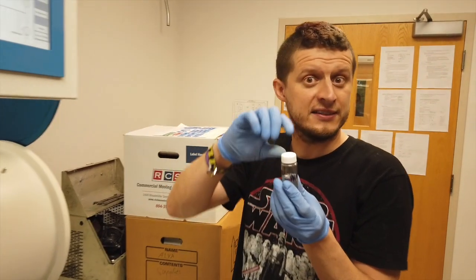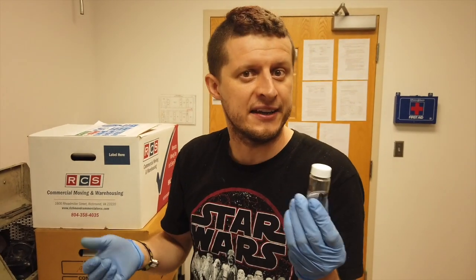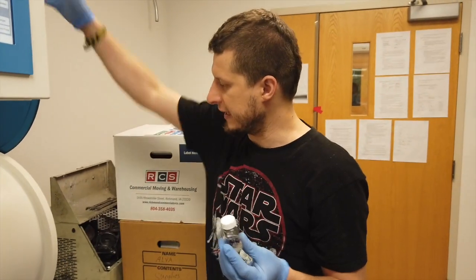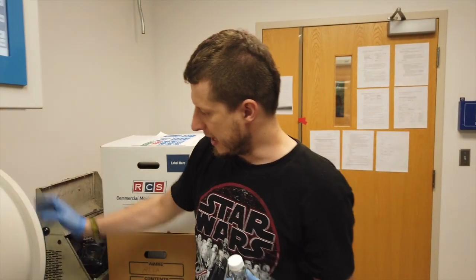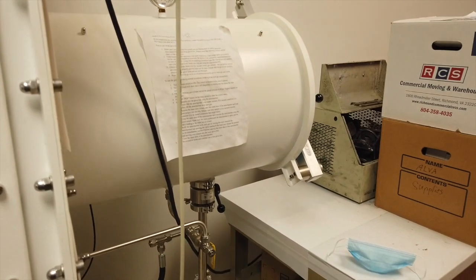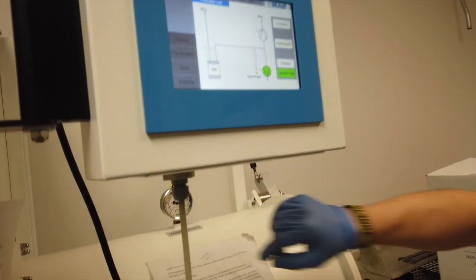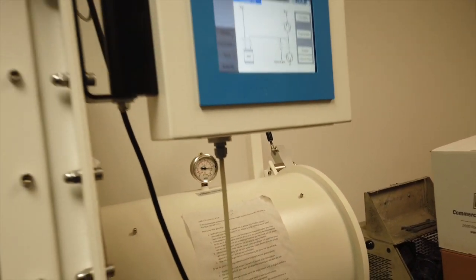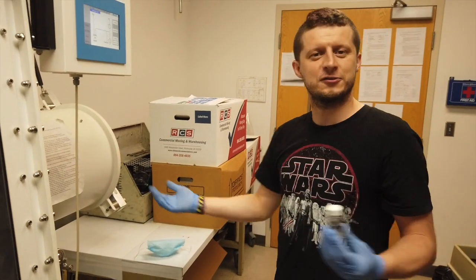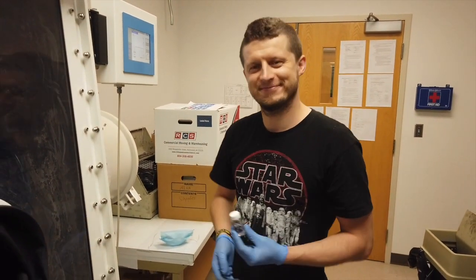So I have my material here. If I open it, it will not like the air, but it will survive a little, like several days. It will be okay. And if I want to take something in, I would use this instrument. It's called a vacuum chamber, a vacuum pump. It will take the air out of it. This is how I transport things inside and outside. So this is what I do, space science in my laboratory.